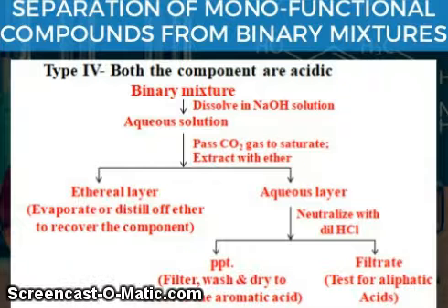So friends, if both the components are acidic, dissolve in NaOH solution, the aqueous solution, pass CO2 gas to saturation, extract with ether. Aqueous layer: neutralize with dilute HCl, precipitate and filtrate. Ethereal layer: evaporate, distill off the ether to recover the components.